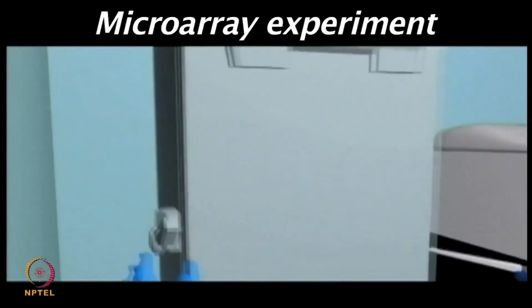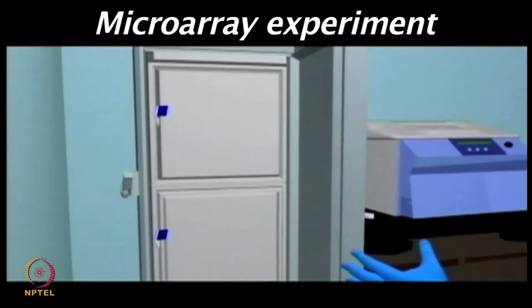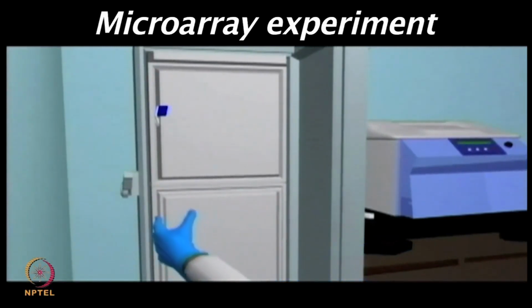So, these chips have to be stored precisely at -80 degrees. You do not want to lose the protein activity if it is a purified protein array. If you are doing cell free expression based protein microarrays, then you do not have to worry. You can store the chips even at room temperature.